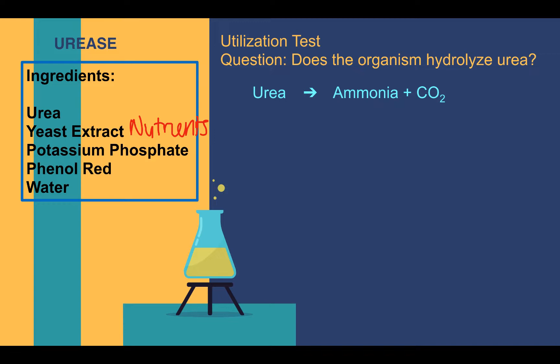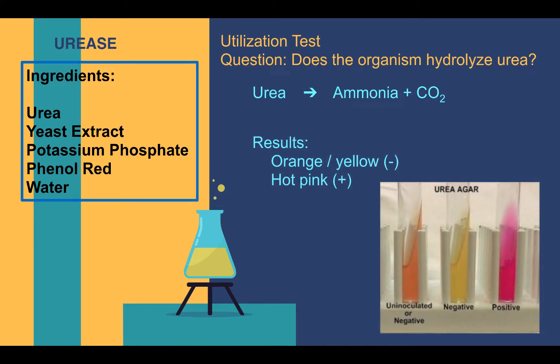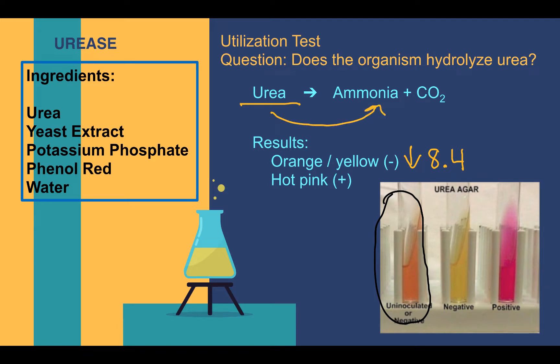The color change is brought about by phenol red. Usually this medium is an orange color, as seen in the circled tube. If the organism is not able to utilize urea, then no ammonia is formed and the pH will remain below 8.4, causing the phenol red indicator to keep the media orange or turn it more yellow. However, if the organism is able to utilize urea, ammonium will be formed. Ammonia is alkaline, so it will raise the pH to above 8.4, causing the color change to hot pink. Therefore, a positive result is hot pink and orange or yellow is a negative result.